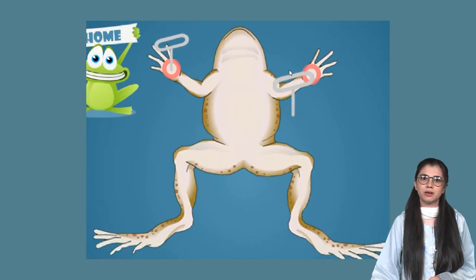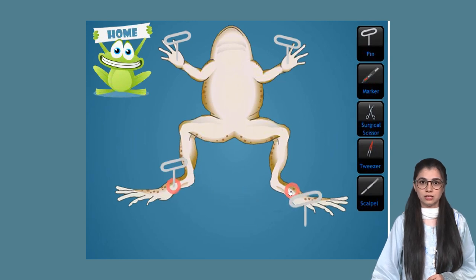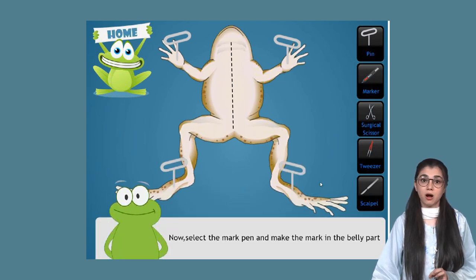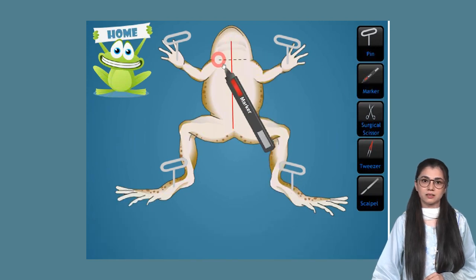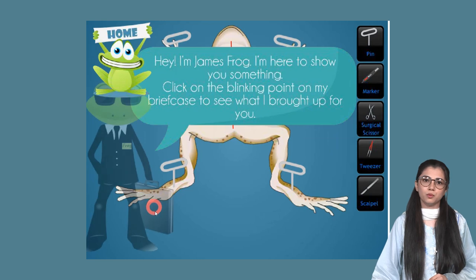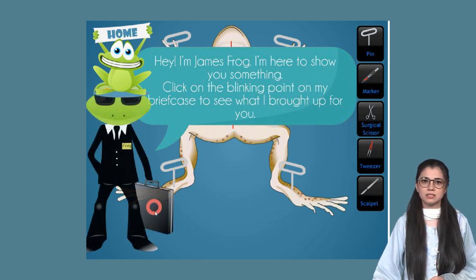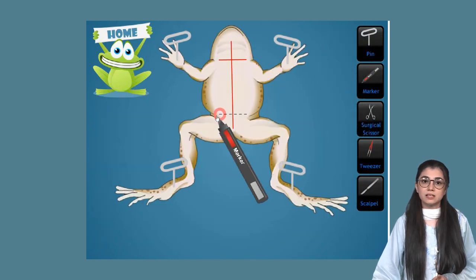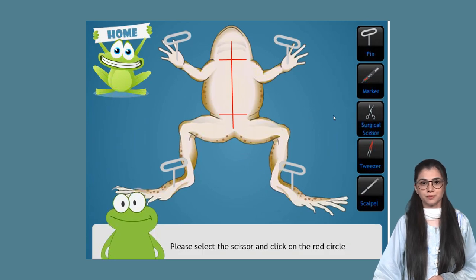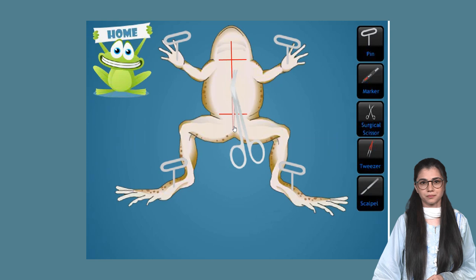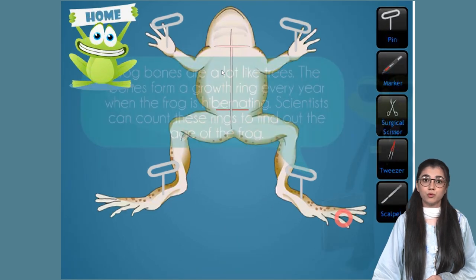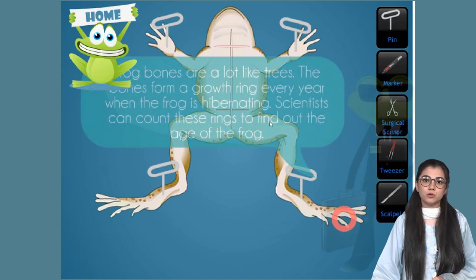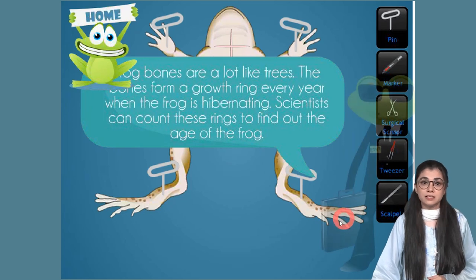First, you are going to pick the pen tool. Click on the red circle to pin it up. Now select the mark pen and mark the belly part. We have James frog with us — he will tell us about the different types of frogs. Please select scissors and click on the red circle. Did you know frog bones are a lot like trees? The bones form a growth ring every year when the frog is hibernating, and scientists can count these rings to find out the age of the frog.